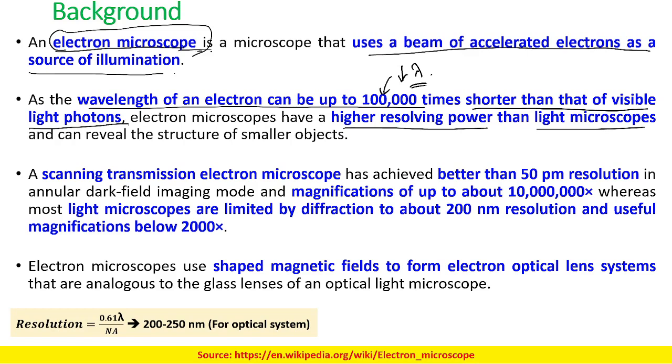What happens is that you collect the light or photons passing through the red filter, green filter and blue filter, and then using software you do some manipulation and synthesize the color.